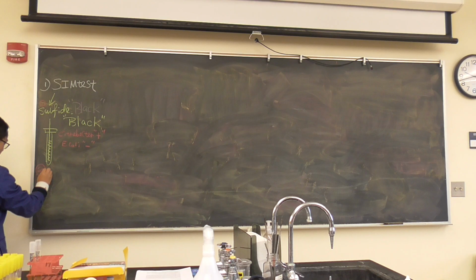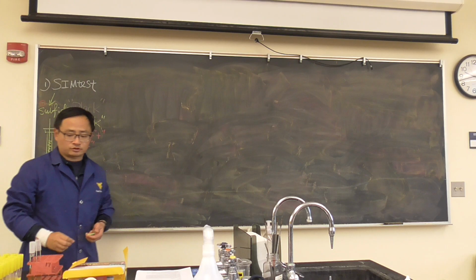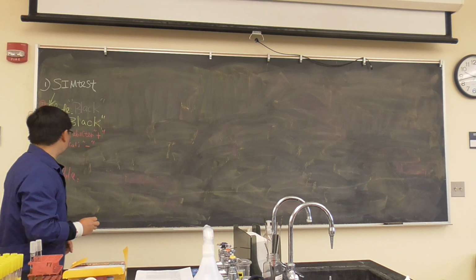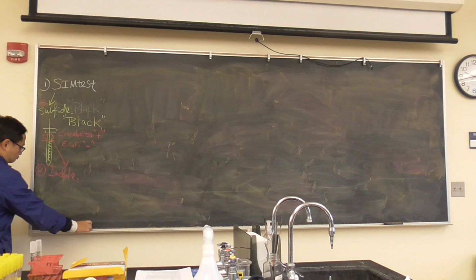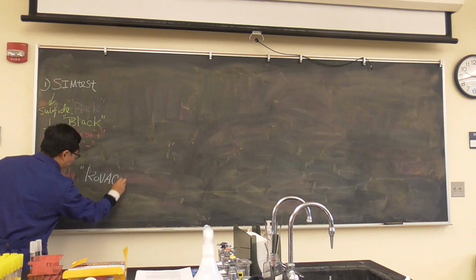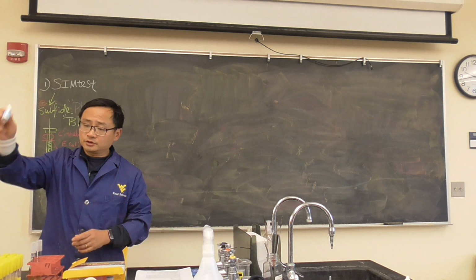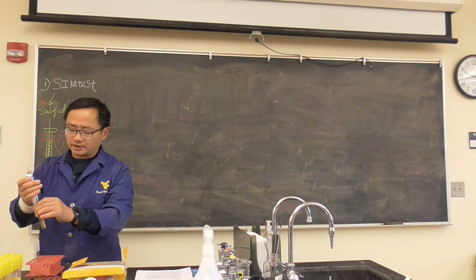Okay, second test, we talk about the indole. You need to know that it is a byproduct of tryptophan. How did we test it? You're not going to see it right now. What we need to do is add a big drop of the reagent called Kovac. So let's do that to see what's happening. I'm going to add Kovac. Now always remember you have to shake. And then let's add to the E. coli side to see what it looks like.